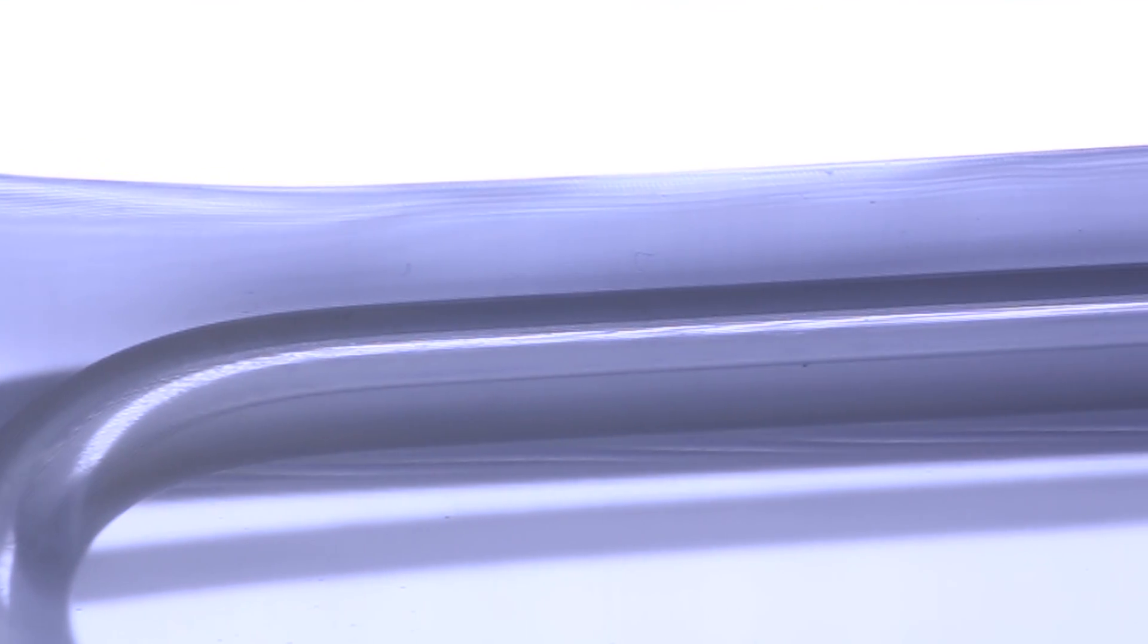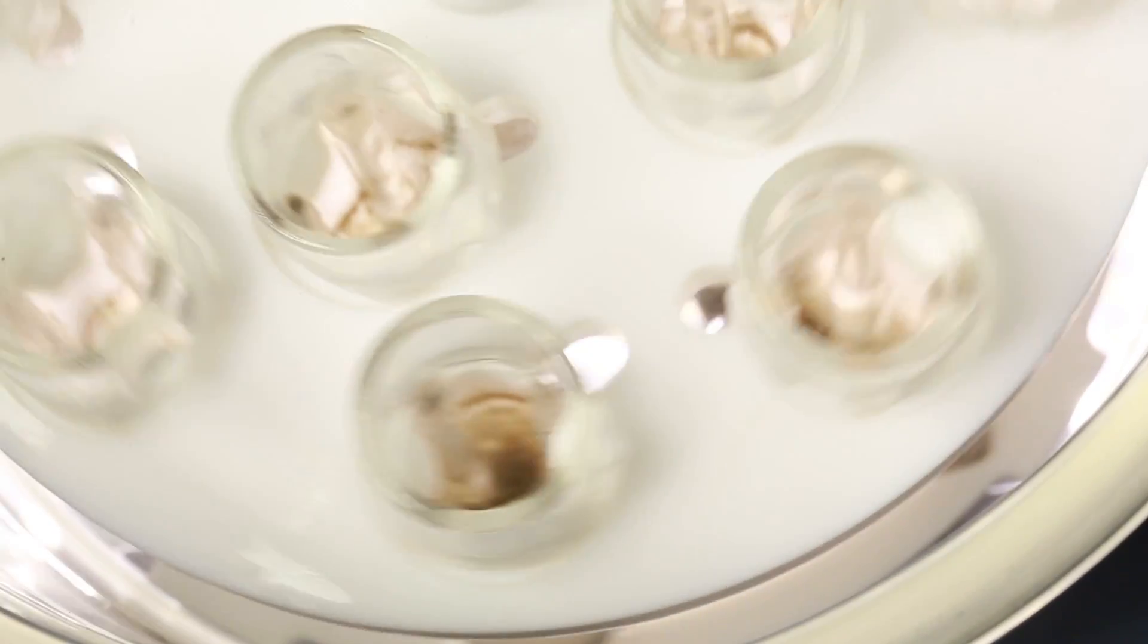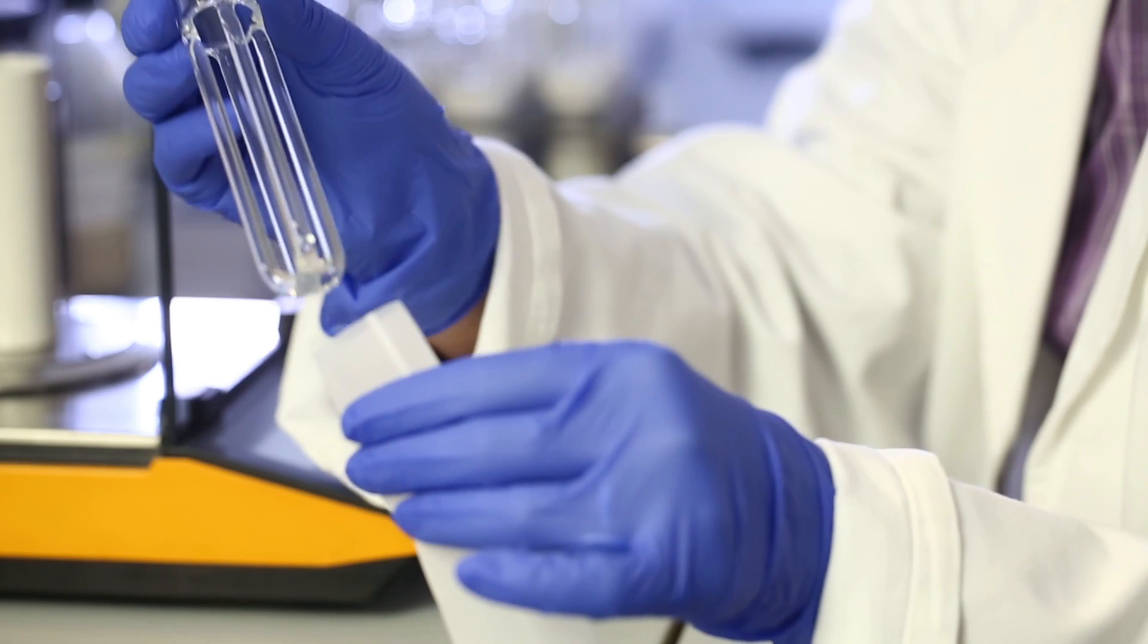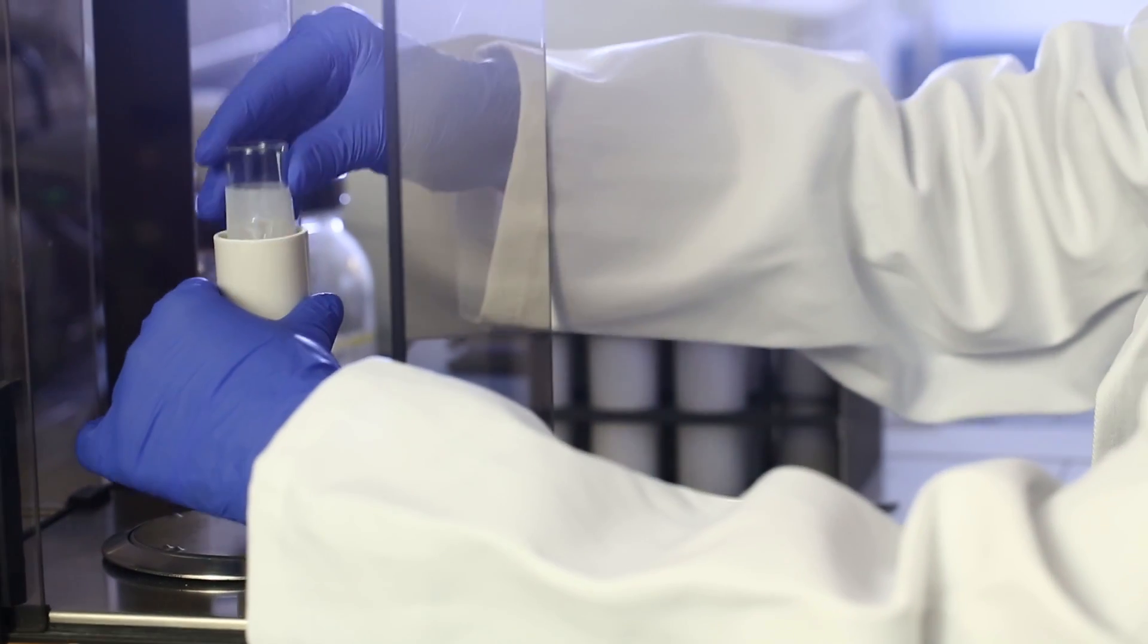The innovative solution is based on this high-precision filtration tissue. It has a defined mesh size, which enables digestion and filtration results to be exactly reproduced. The glass spacer ensures that the sample is optimally wetted and bathed at all times.